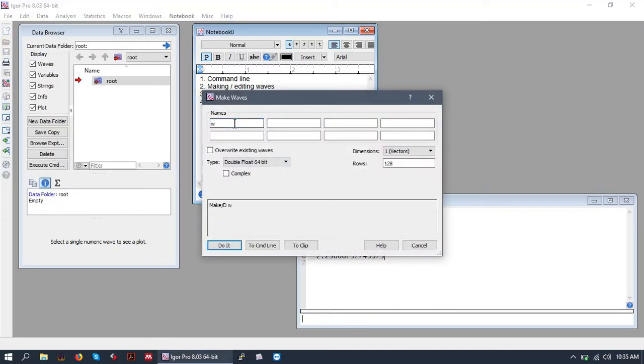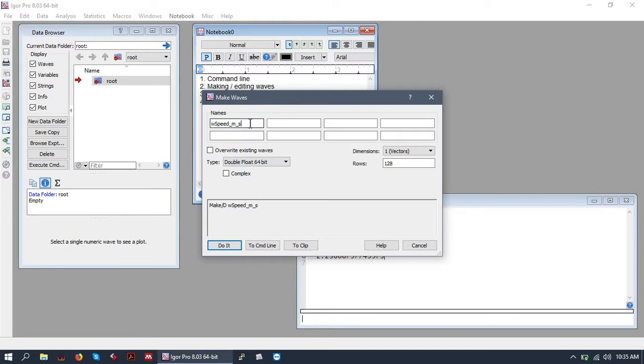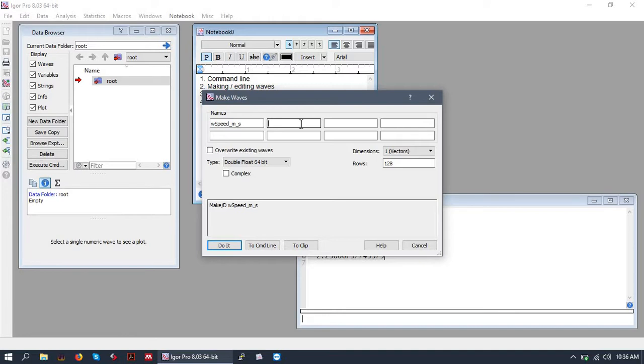I like to precede my wave names with a W to keep things straight. And we'll name this wave speed in meters per second. I also like to include a little abbreviation of the units in my wave names. You can have intrinsic units on waves, but I generally don't do this. I just have never gotten in the habit of doing it, but it's probably useful.